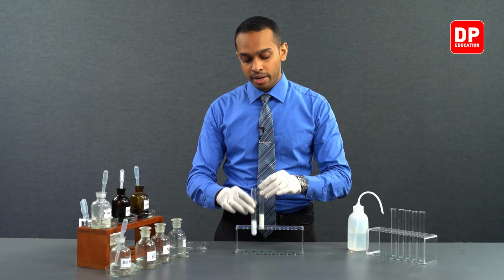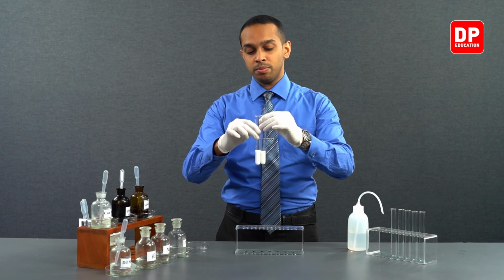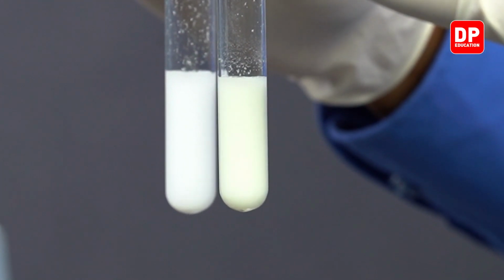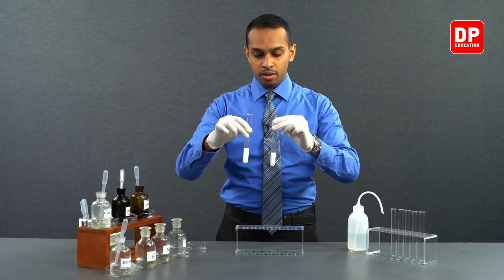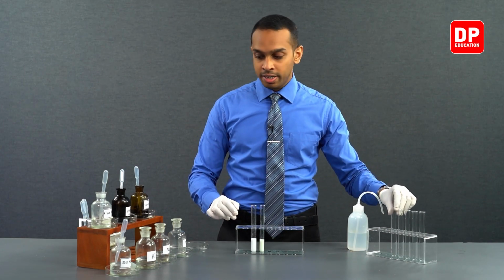Right, so the silver bromide has a pale yellow color. When you are comparing the two, you will be able to observe the two colors very clearly. Right, now let's move on to silver iodide.